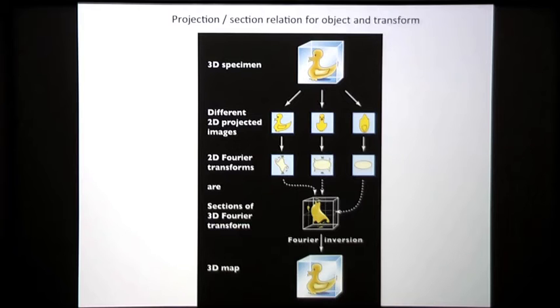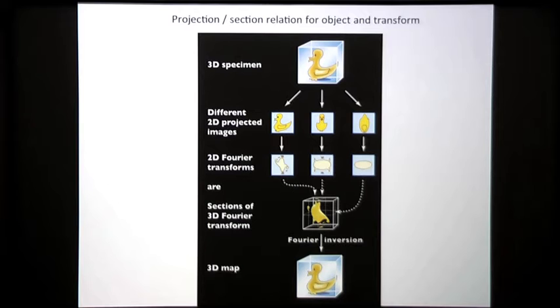We don't have that problem in microscopy because the microscope recombines the diffracted beams from the objective aperture to give you an image. And in this image, not only is the intensity of each Fourier frequency encoded, but the relative phases as well, because we know where things are, so you know what the phases are.